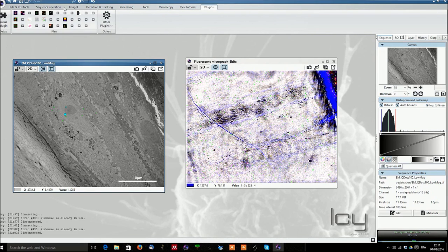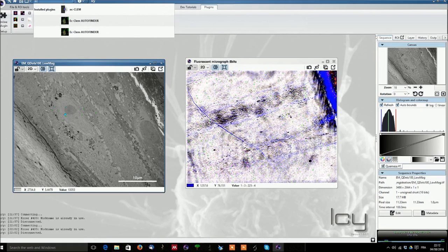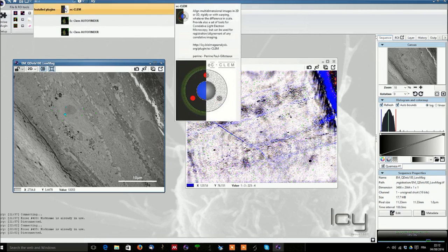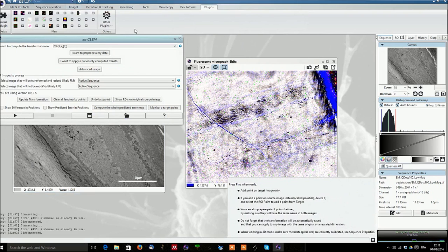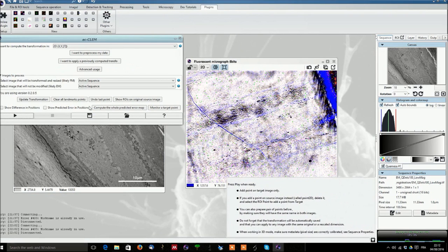Last but not least if you want to launch a plugin or search for plugin go into the search bar and type the plugin of interest here in that case ec-CLEM and you can just simply start the ec-CLEM plugin and start doing your image processing or image registration.